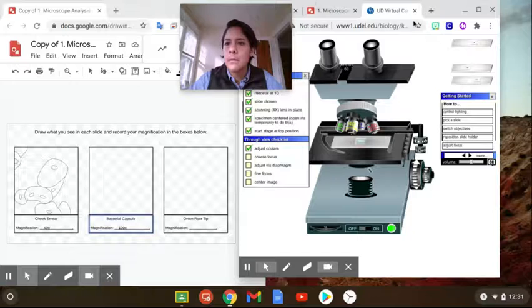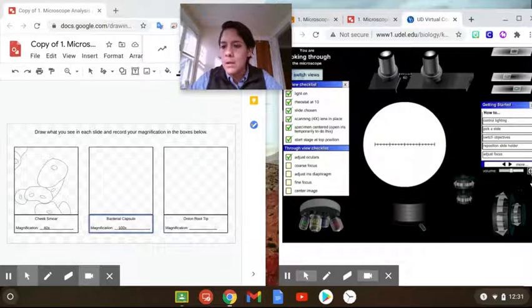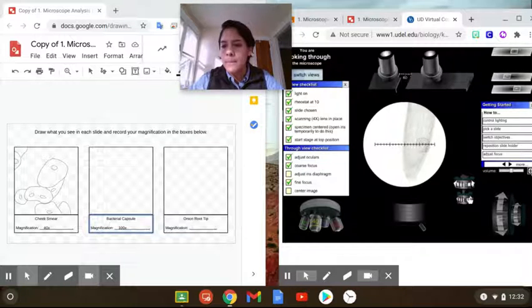Okay. So now I'm going to come to switch views. So as long as you make sure that the object is under the light, if you don't see anything initially, I recommend hitting this down twice. And then you're just going to want to make sure you're always looking at your specimen in the middle. So there's that red circle here. So you just want to move it to the middle of your microscope, because as you zoom in, you're gonna focus in on that circle.